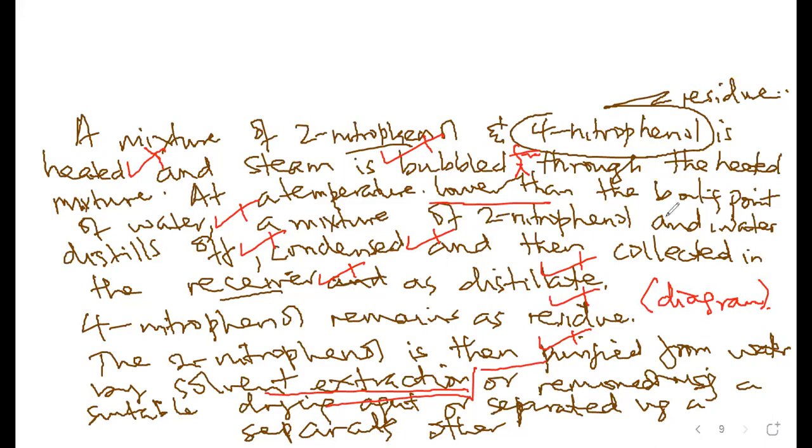Ali, you have a question? Yes, teacher. Ask very fast, time is against us. Teacher, in our mixture, we have 2-nitrophenol and 4-nitrophenol. So the steam, the water we are using to get steam, is not mixed within the two components of the mixture. It is not part of the components. If you remember the definition of steam distillation, we are collecting a volatile component from its impurities. So the water comes in as a third component. Are we together?